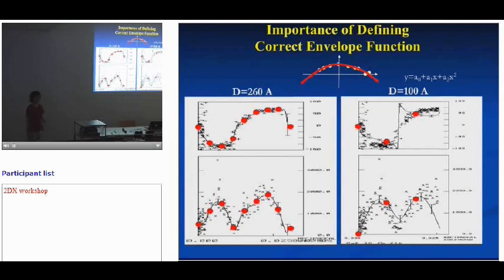It's especially thick. It's much thicker than a normal membrane crystal. And so I have to use 260 angstrom to fit the lattice line, in order to follow the trend of all the data. How did you pick 260, not 250 or 300 or 400 or 1,000?